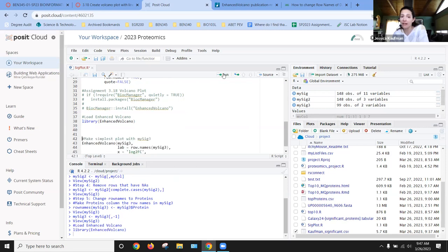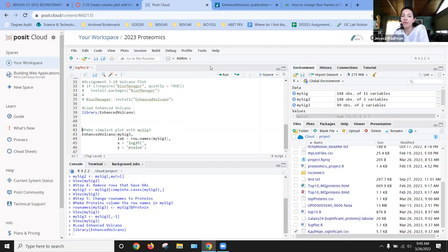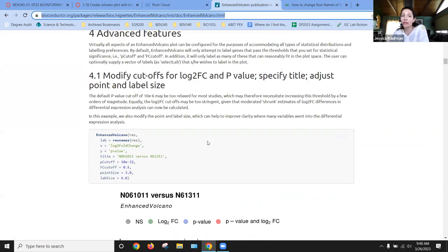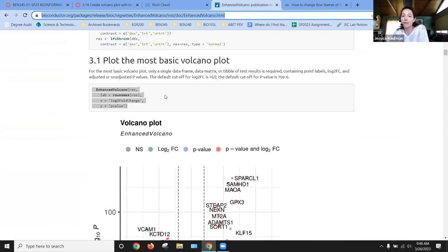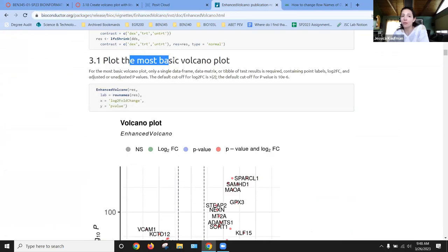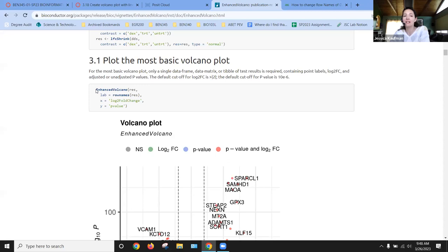So I'm going to run enhanced volcano, make sure that the tool is loaded, and then I'm going to copy the example from the tutorial for how to make the simplest type of plot. The most basic volcano plot seems like a good place to start.